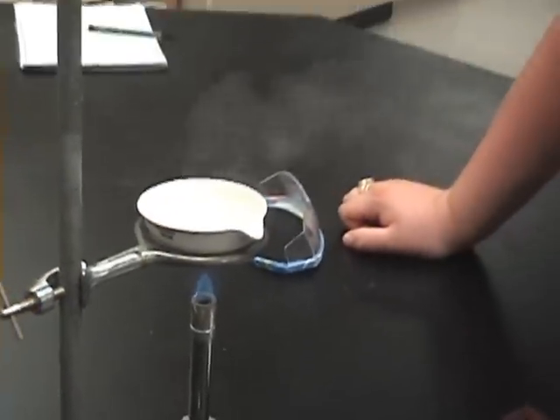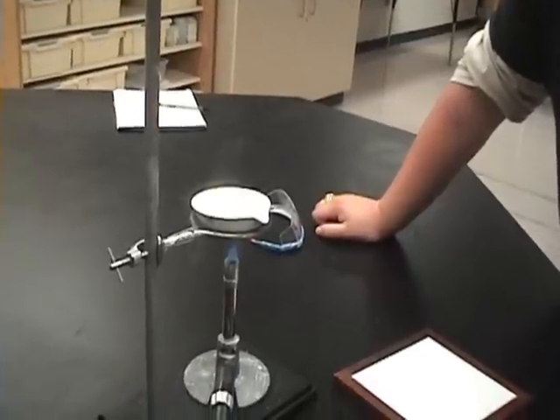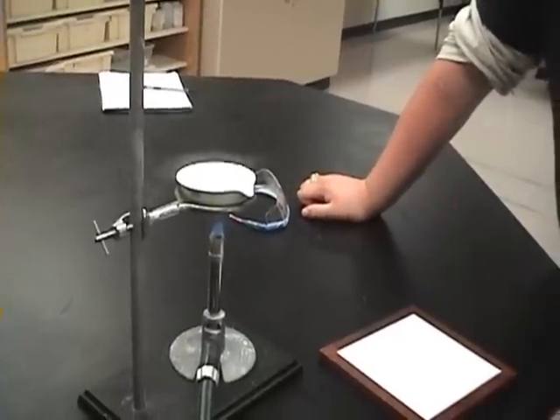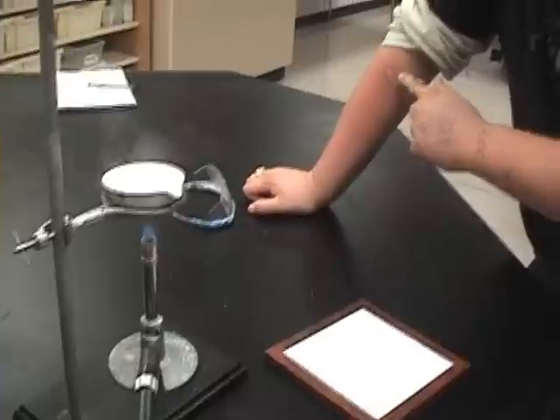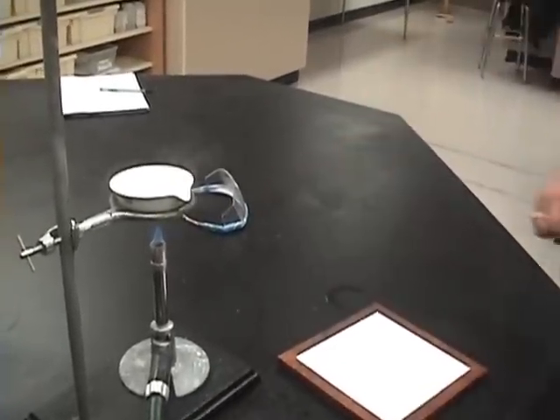If it starts spinning, you might want to back away — it might burn a lot. See that? That's a burn. Feels pretty good. I'm just going to go ahead and turn the gas off now.